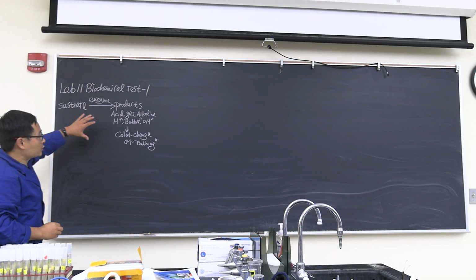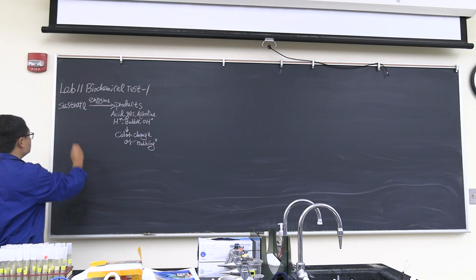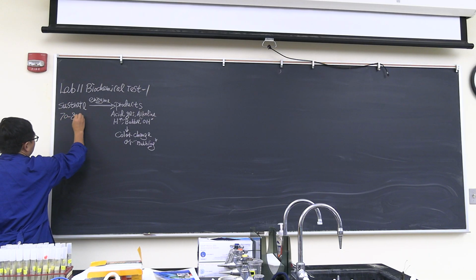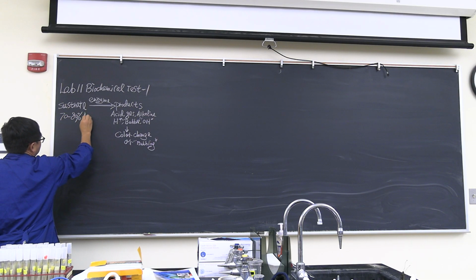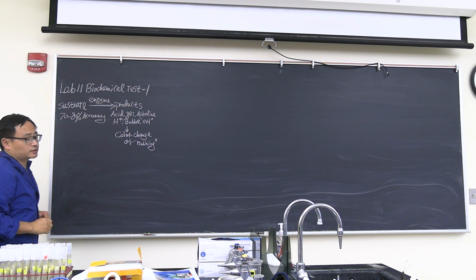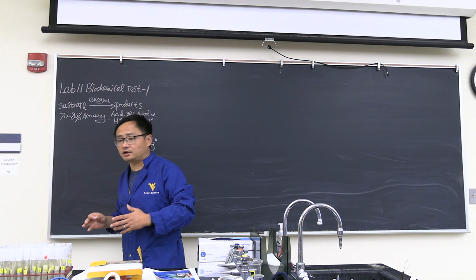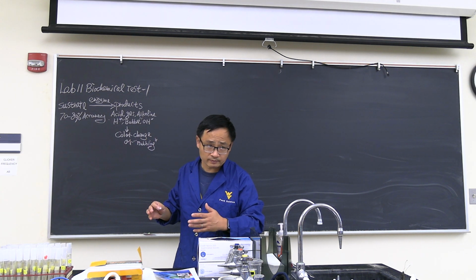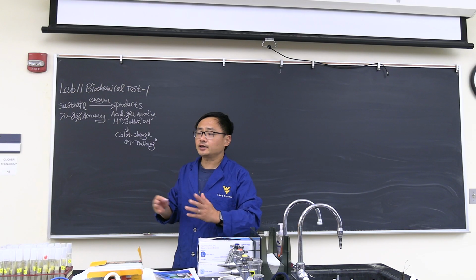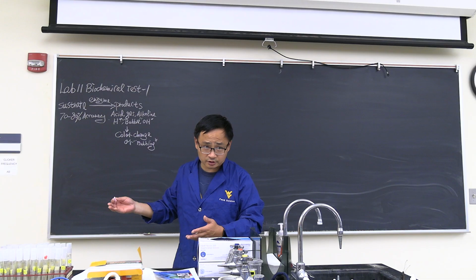Now, how accuracy the biochemistry test to determine a bacteria? Usually 70 to 80% accuracy. The reason is that lots of the bacteria, they will result the similar or same biochemistry results. So we cannot solely rely on biochemistry test.